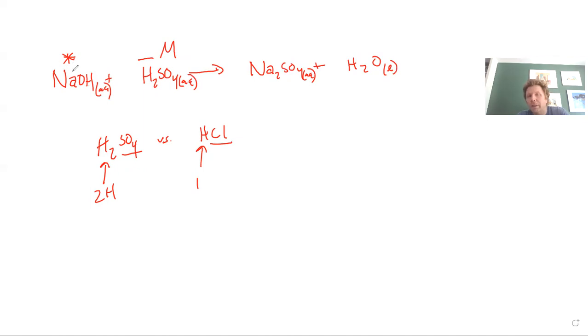So you will need to use the volume of sodium hydroxide and the concentration to figure out, based on the 25 milliliters or so that you use, the specific amount of H2SO4, what is the concentration of that H2SO4 solution. You'll do this a total of 3 times. Like last week, the first time you do it will make the second and third times easier to do. I hope this is helpful.